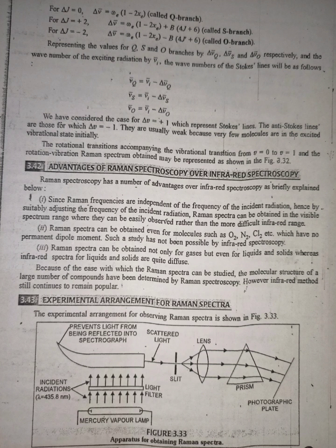First, since Raman frequencies are independent of the frequency of incident radiation, by suitably adjusting the frequency of incident radiation, Raman spectra can be obtained in the visible spectrum range, where they can be easily observed, rather than the more difficult infrared range.